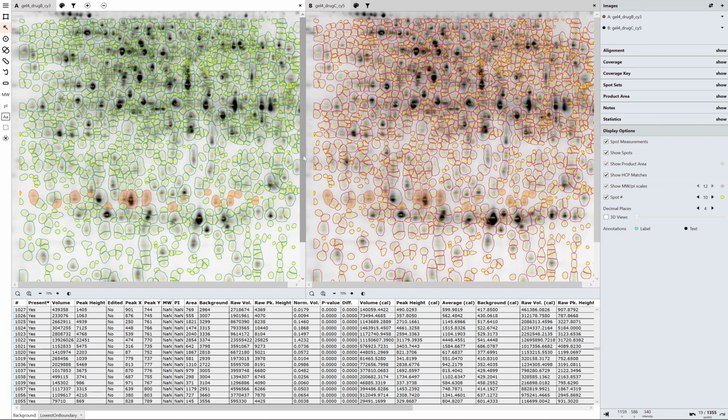So I hope this was helpful. This is just a quick little tutorial on a slightly hidden by default feature to allow people that are interested in extracting that level of data from their images. We can do it within the SpotMap software, and in fact we make it very easy within the SpotMap software for you to gain access to that data. But conversely, if you just want to stay away from that data and say, I just want to know my coverage score, we also make that as automatic and easy as possible as well.